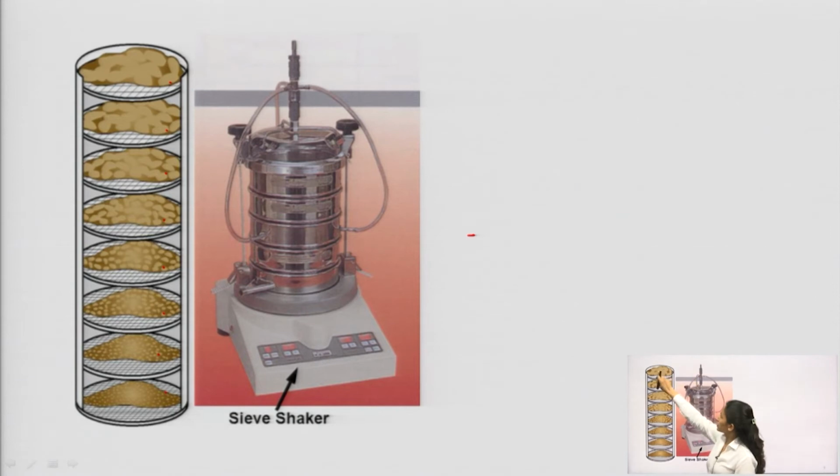In the topmost sieve, we pour the powder particles, then rotate the mechanical sieve shaker for 2 to 5 minutes. After operating it for 2 to 5 minutes, switch it off and remove the assembly. After removing the assembly of sieves, in the next step you remove each individual sieve, weigh the powder retained on each sieve, and tabulate that data in a particle size determination table.